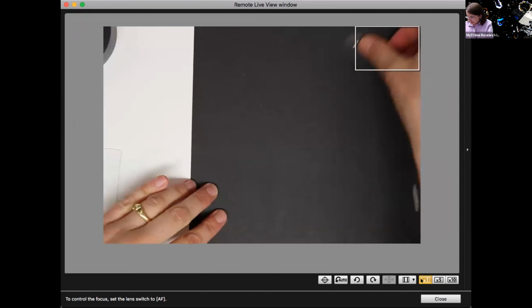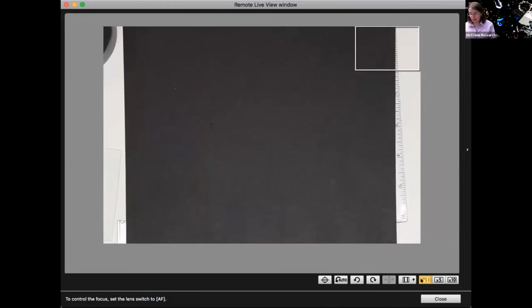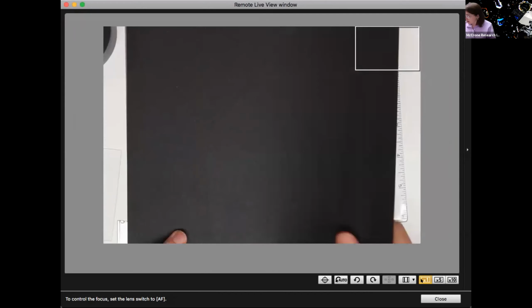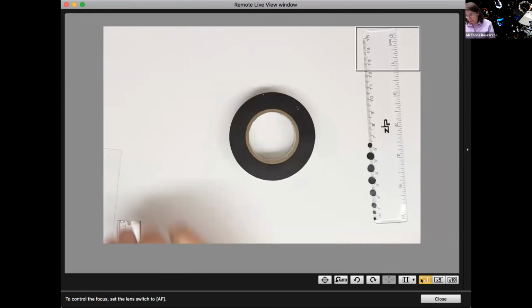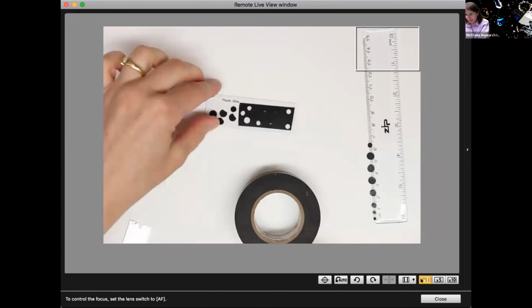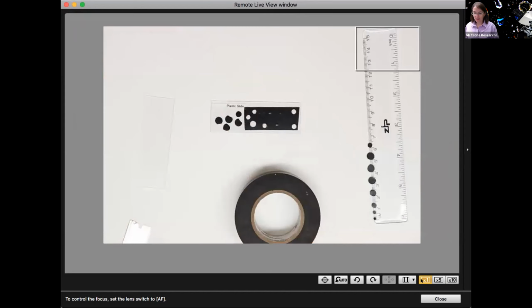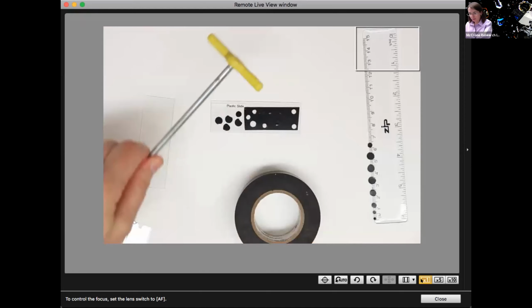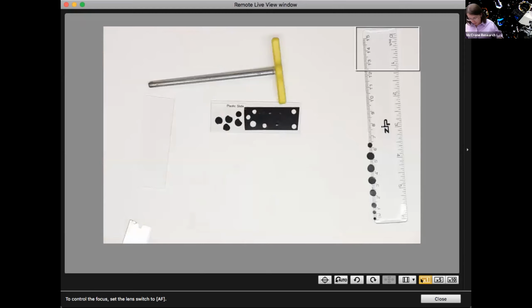Again, it's not that complicated, but I wanted to show you how to make them in my preferred way, which is going to be using electrical tape. So what I've got to begin with is my electrical tape. I took the liberty of putting some on a plastic slide. If you put it on a plastic slide, that means you have a nice soft cutting surface for it, because I'll be using one of these hole punches. So I've got a plastic slide, and my electrical tape is already on there.